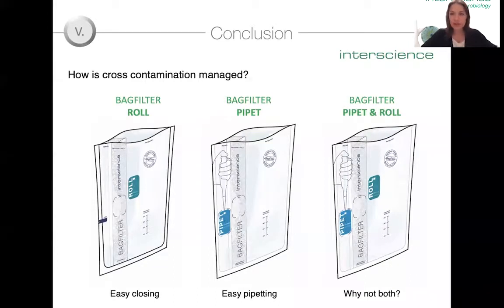There's a question about whether you need to autoclave the bags. You don't need to autoclave them. They're sterile when we send them to you, and they're packaged in packs of 25. When you open the package, just open it in a sterile environment, and you're good to go.